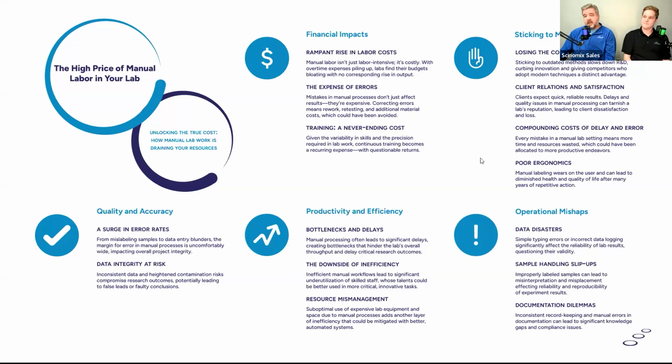Operational mishaps: again, with that work list, you know that you have already processed the barcodes that you need, instead of creating them on the fly. So that will be an effective way. Slip-ups: again, with the barcode validation, you know what's in the work list and what should be printed. You're validating that that barcode is what you said it was.